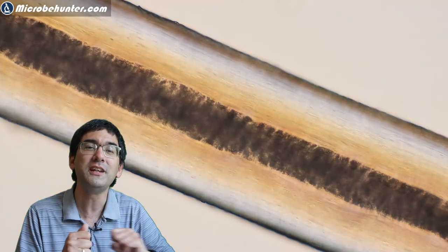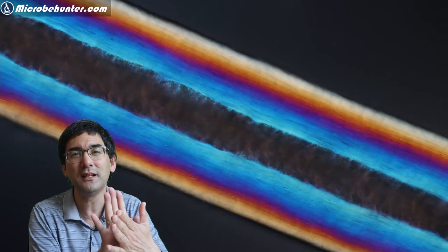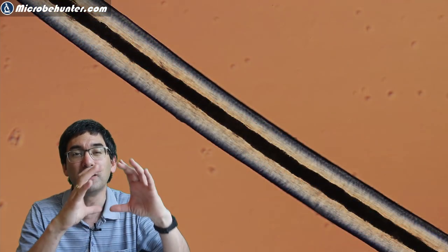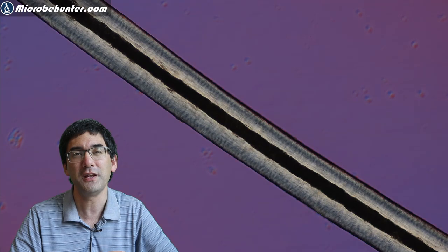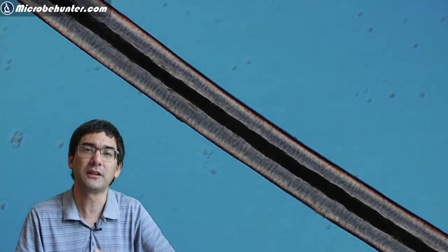If you watched one of my previous videos where I put some beard clippings under the microscope, you can actually see in the cross section there are different regions of the hair. In the cross section, you can see the central part also being of a different color.